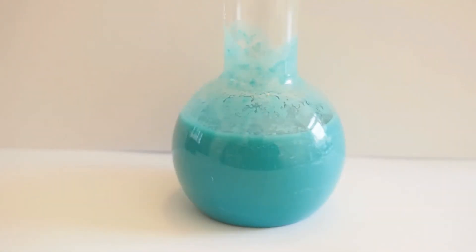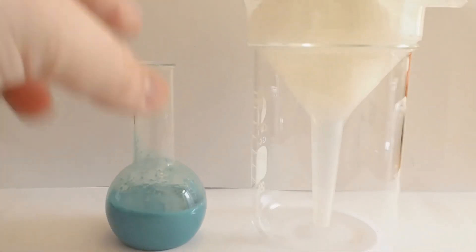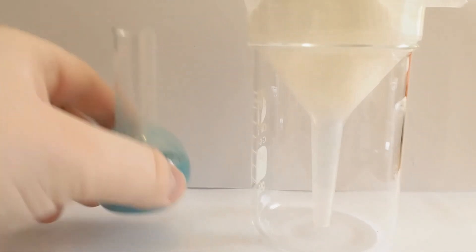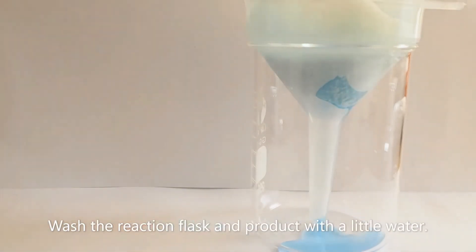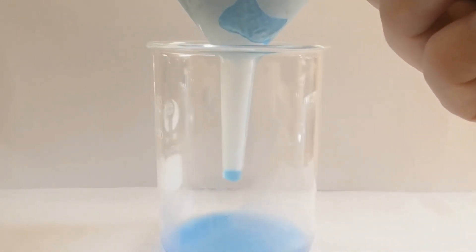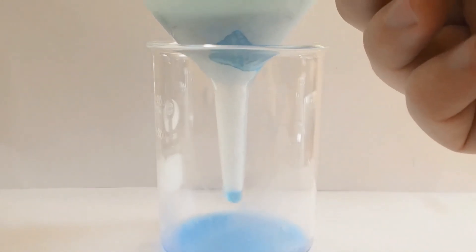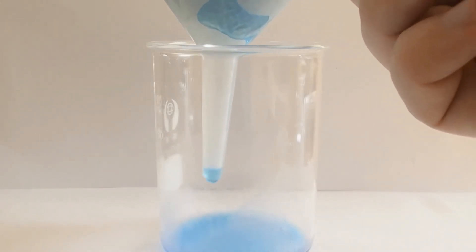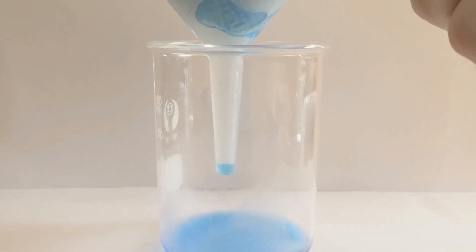So we're going to let this sit for a little while so that all the copper sulphate can react, then we'll clean it up and have a look at the colour. We're going to filter this through some kitchen roll. You can see that the solution coming through is still very blue, so I should have waited longer to allow this reaction to go to completion, because there's still copper sulphate in that solution.